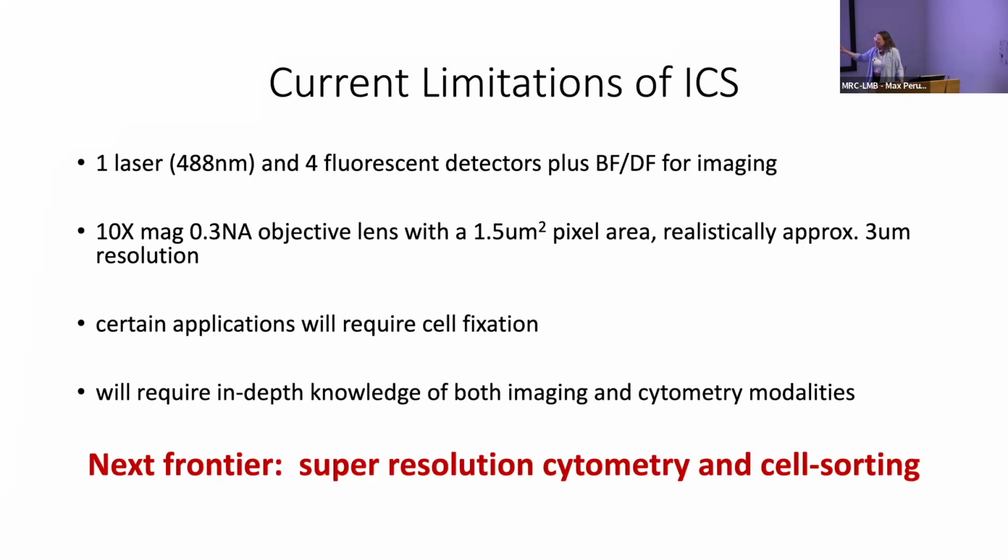The cell sorting decisions are very rapid. So to have super resolution and blur-free imaging is going to be much, much more challenging, but I am very confident I will see this in my lifetime. So I think the field right now is absolutely exciting, and look out for what's coming, because I think it's going to be very fun.